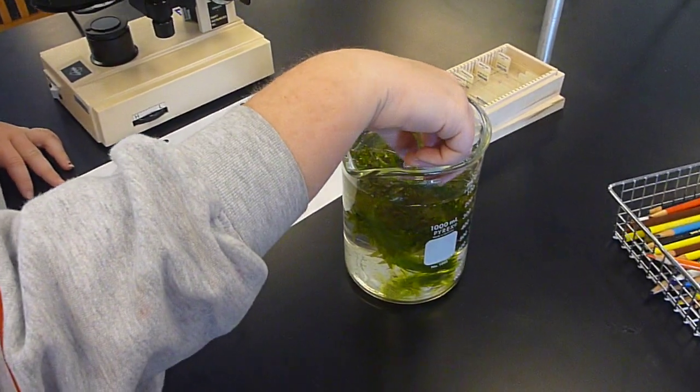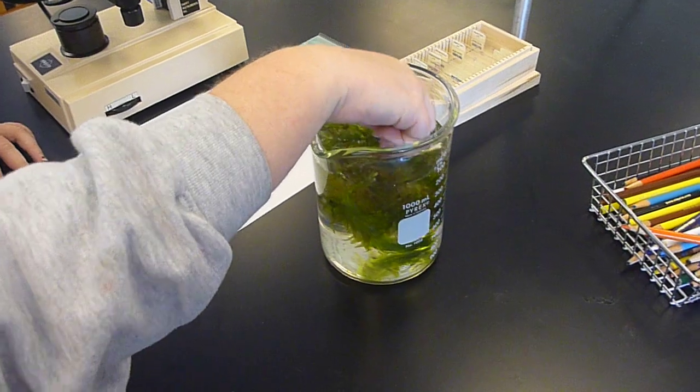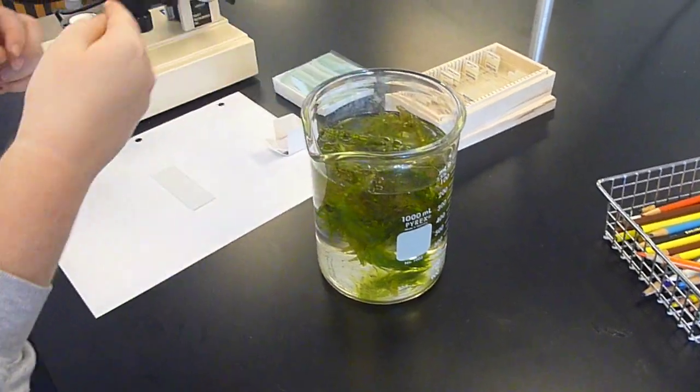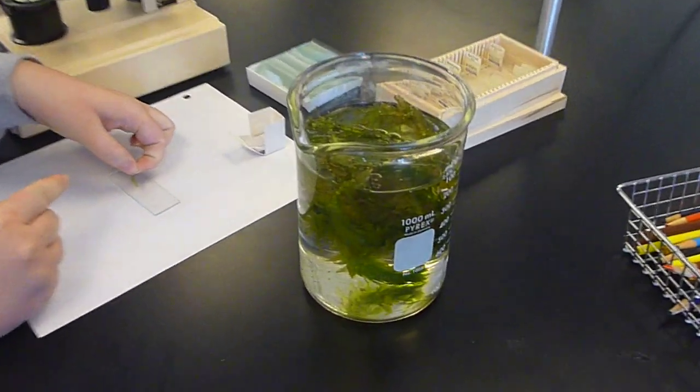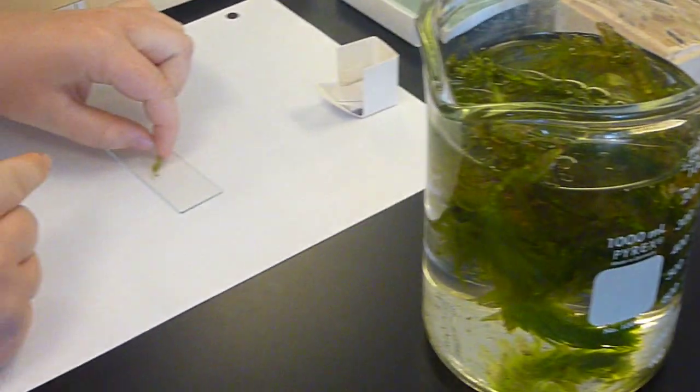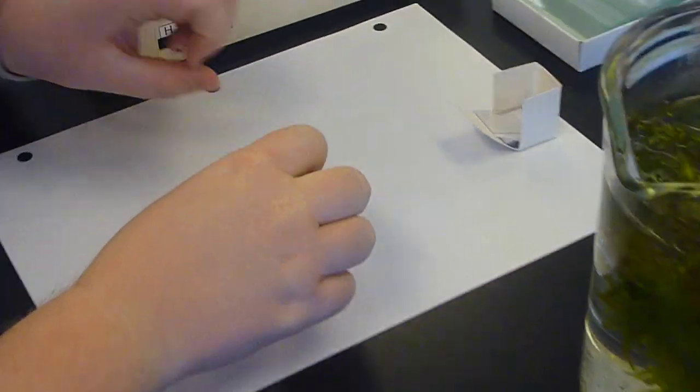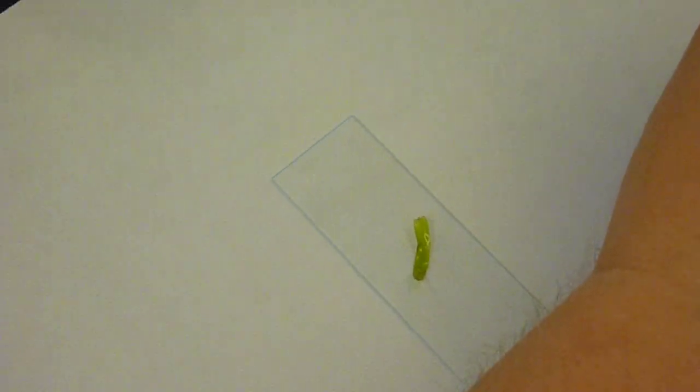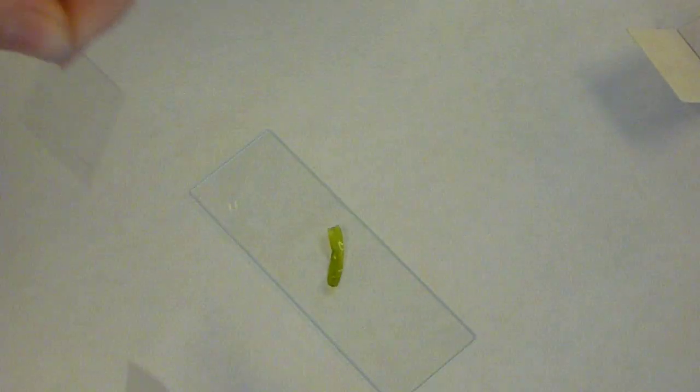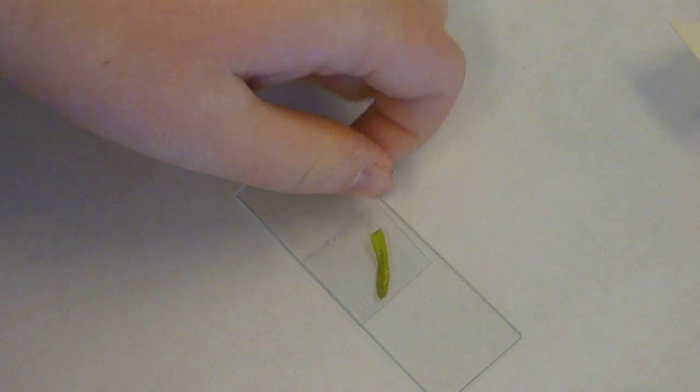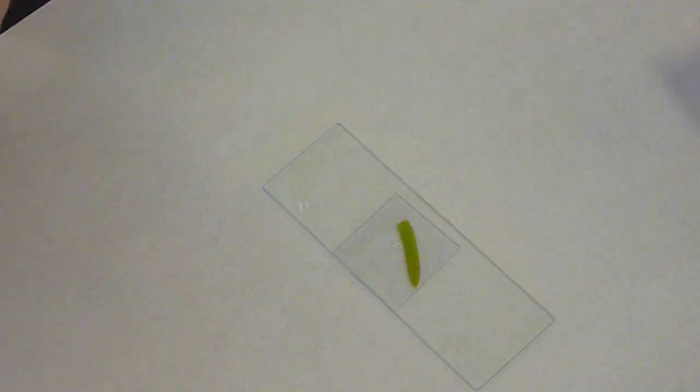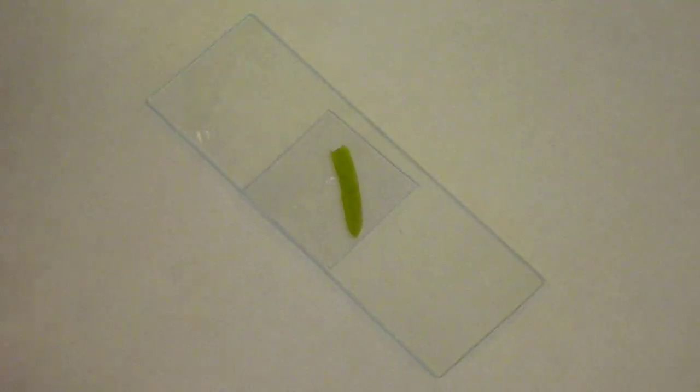So Sarah's going to demonstrate how to prepare a slide of a common aquarium plant called Elodea. Do you notice how she reached in and just grabbed a little leaflet? She's placing it flat on a glass slide and then she's going to put another slide, a smaller glass or plastic slide on top of it called a cover slip. And that's well done.